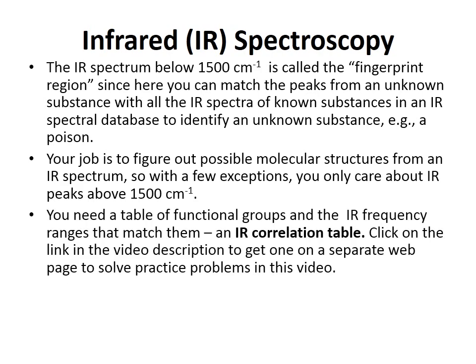Now you're going to need a table of functional groups and the IR frequency ranges that match them. This is called an IR correlation table. Click on the link in the video description to get one on a separate web page to solve practice problems in this video.